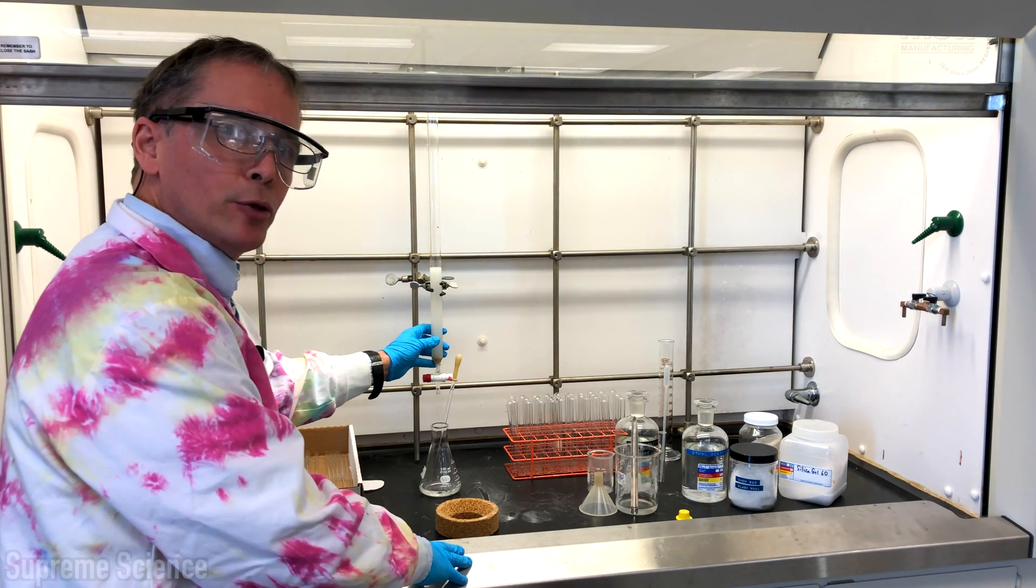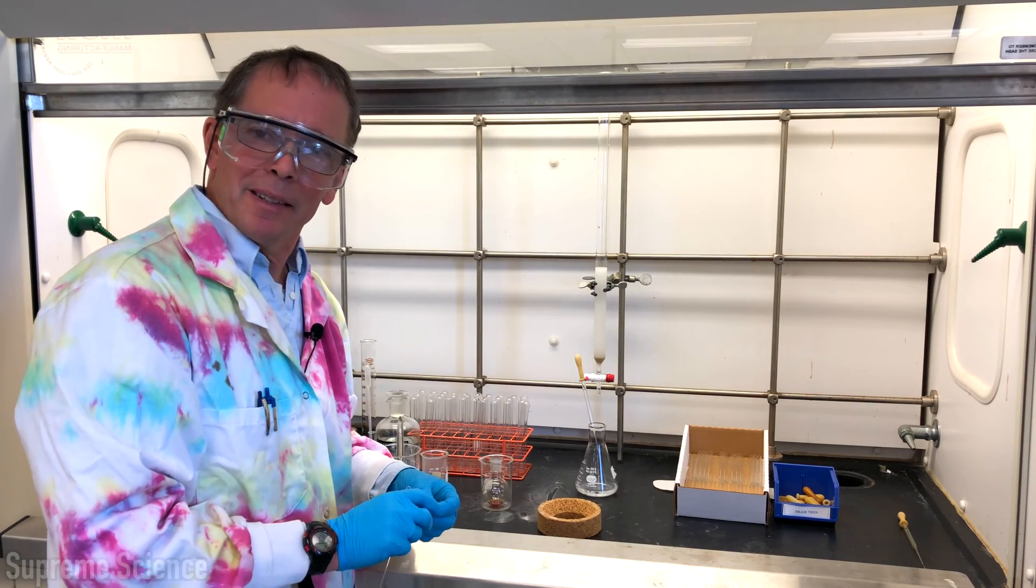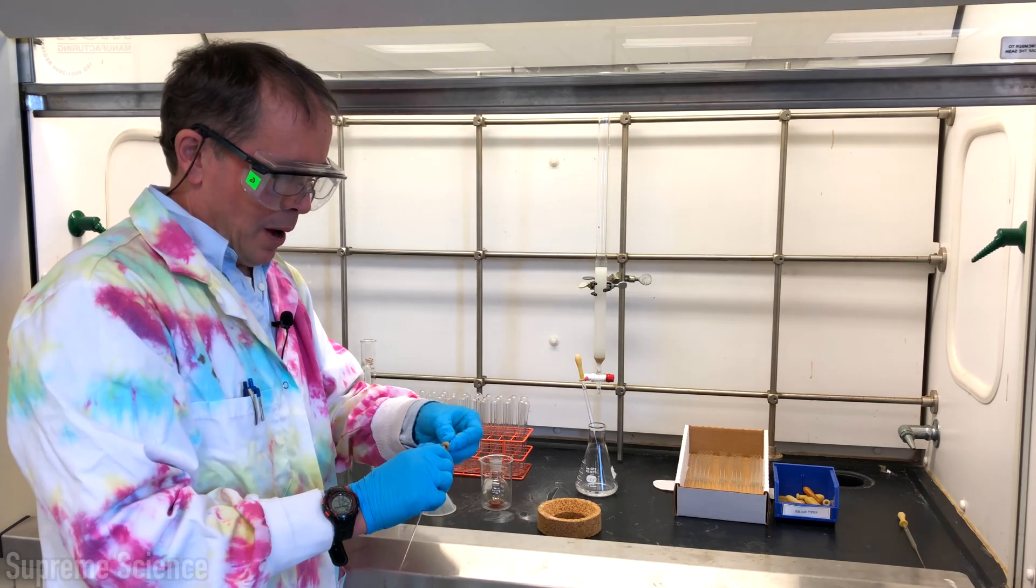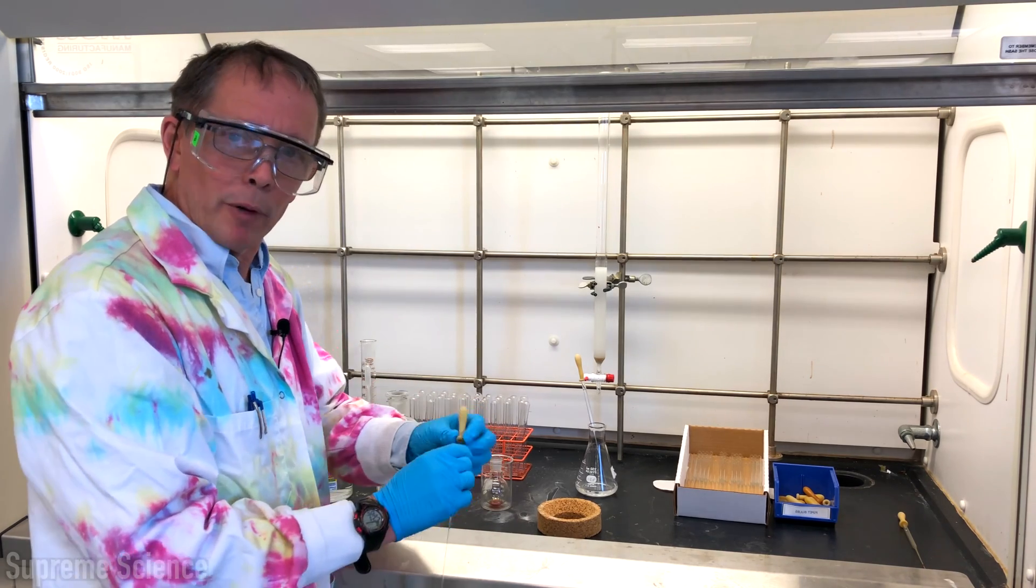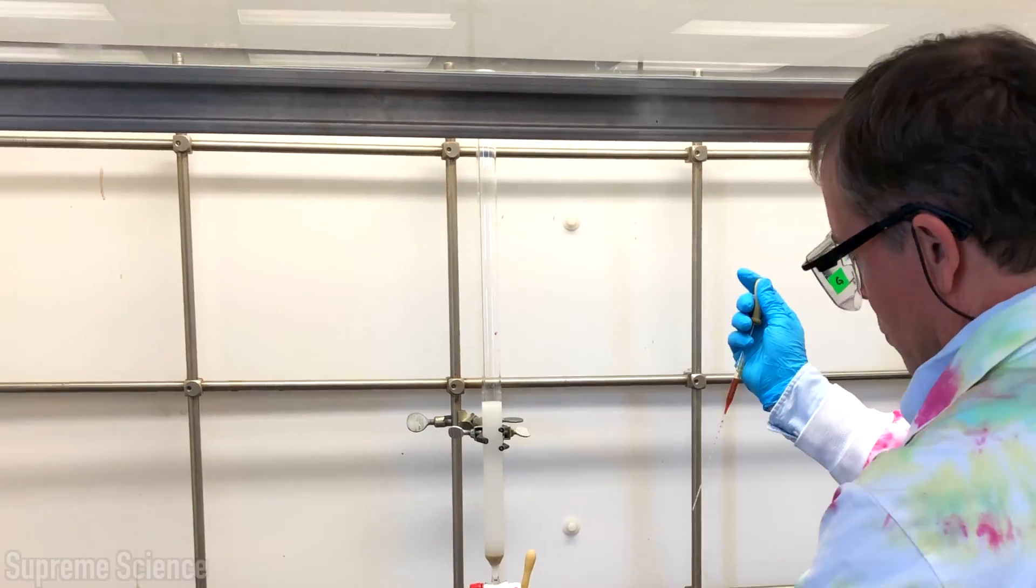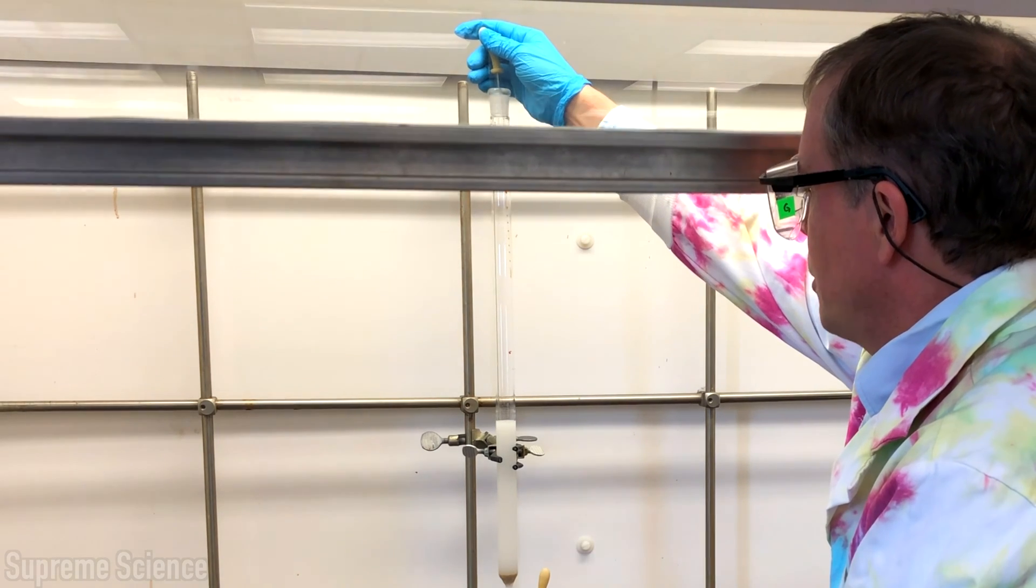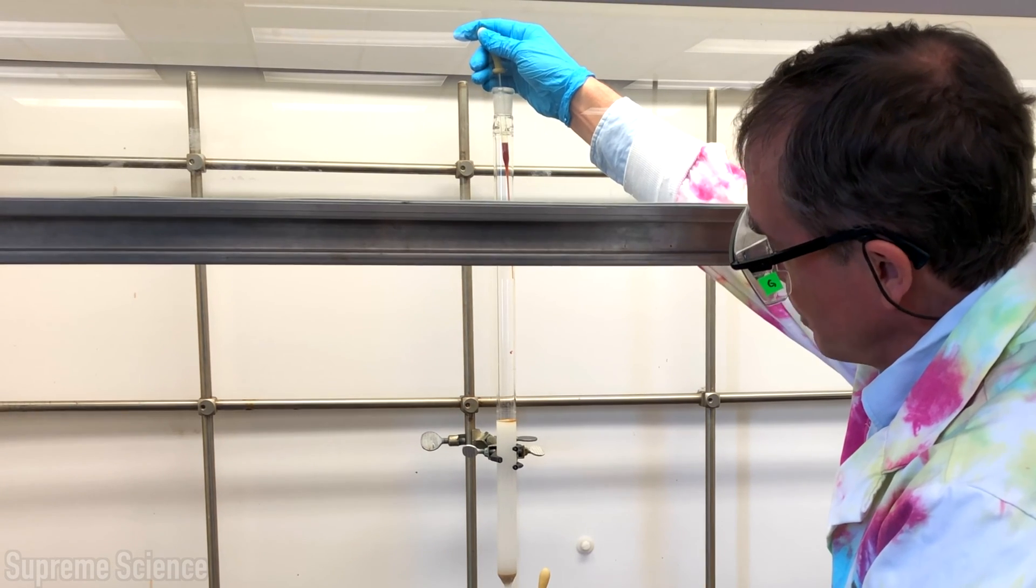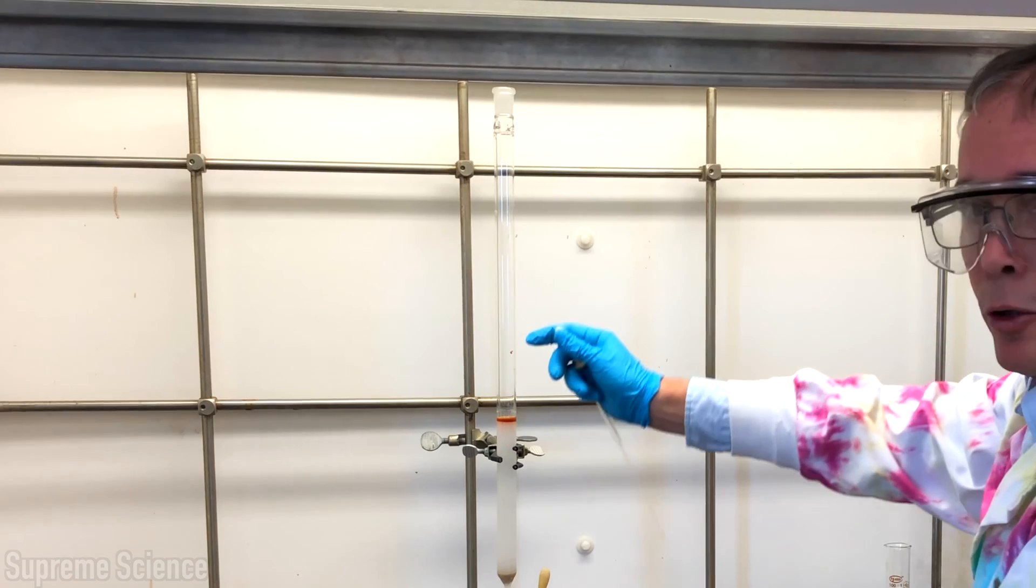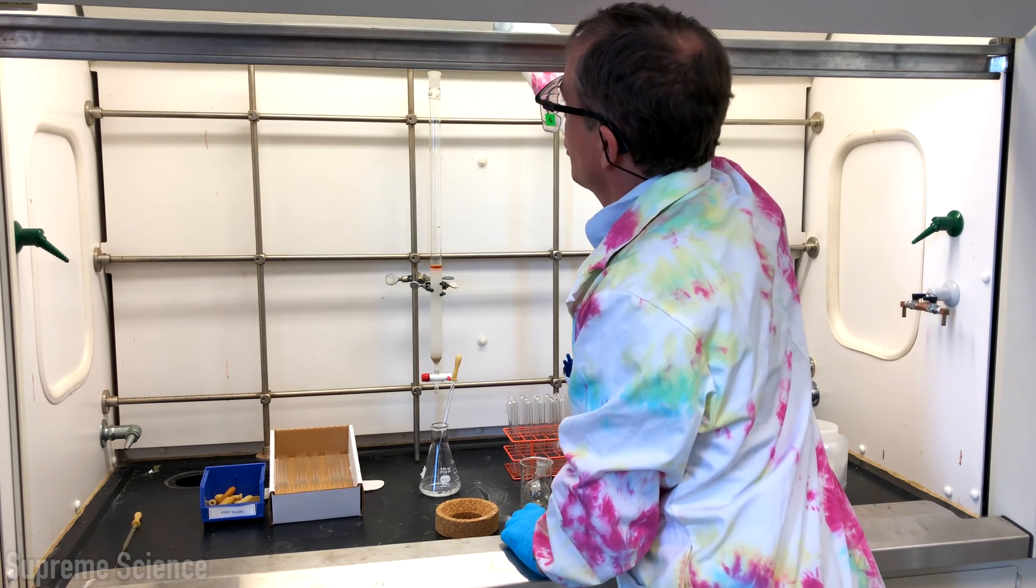Now we're going to load our mixture of chemicals to be separated onto the top of the column. Preparing a pipette as described in our video over here, I will now pipette our reaction mixture onto the top of the column. I'm going to put the pipette as far down into the column as possible and let the compound drip down the side of the column just in one place and it's now at the top of the column.